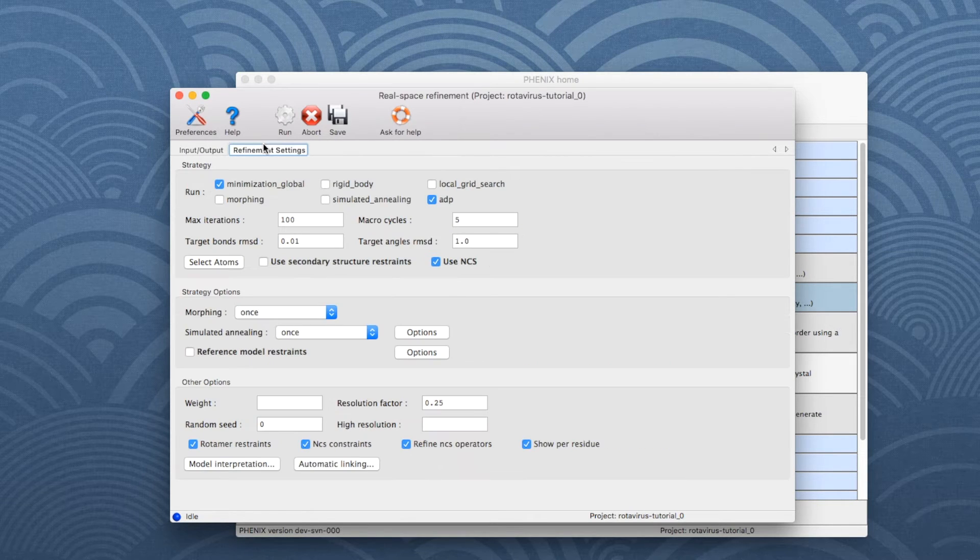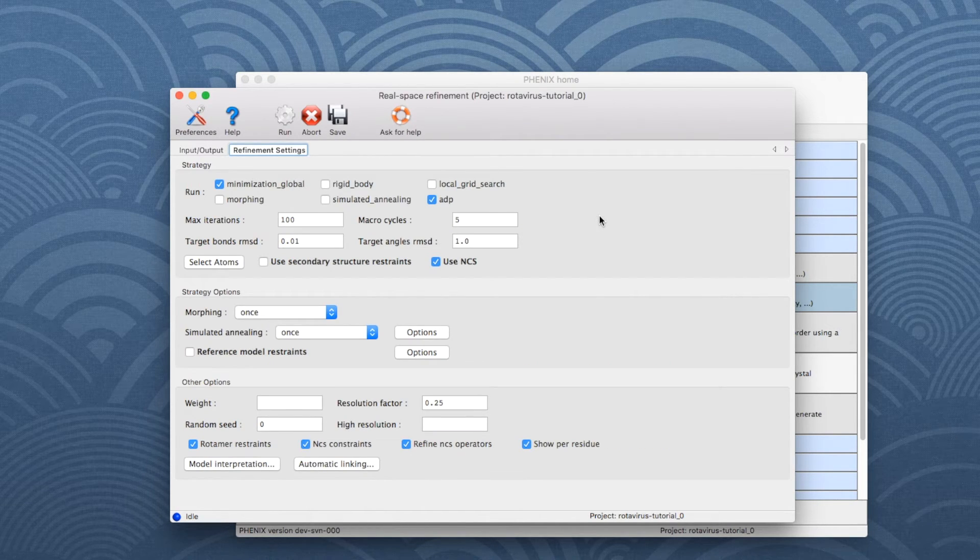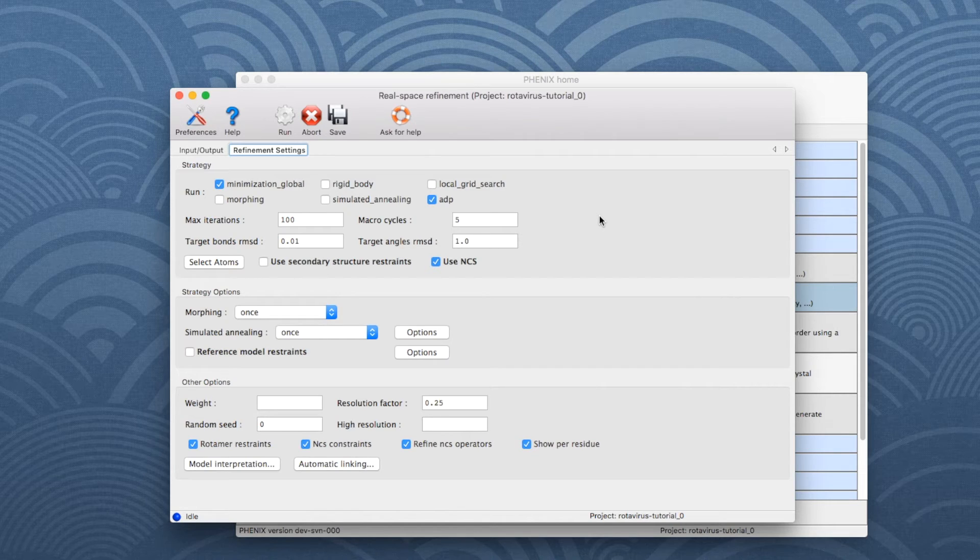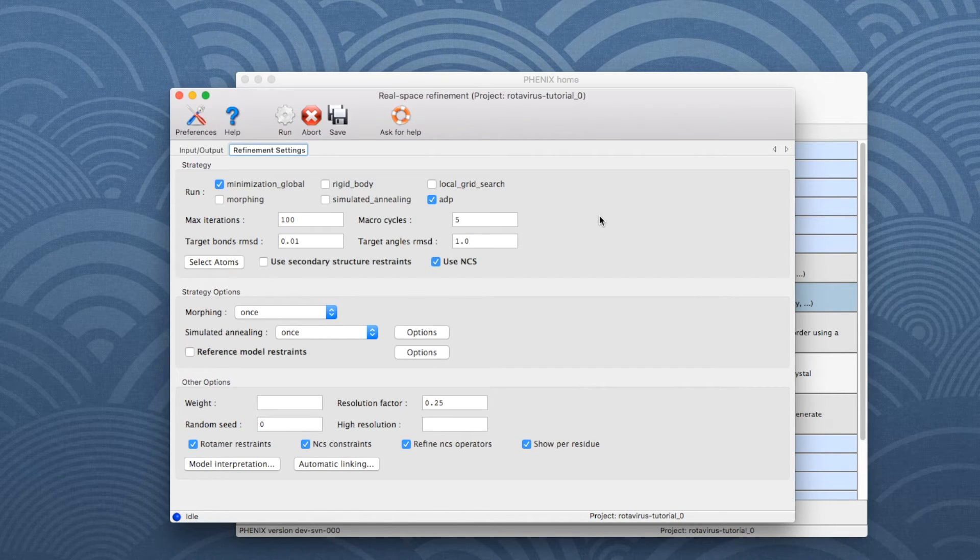Then go to the Refinement Settings tab, which contains most of the essential options for running RealSpace Refine. The following options are activated by default.